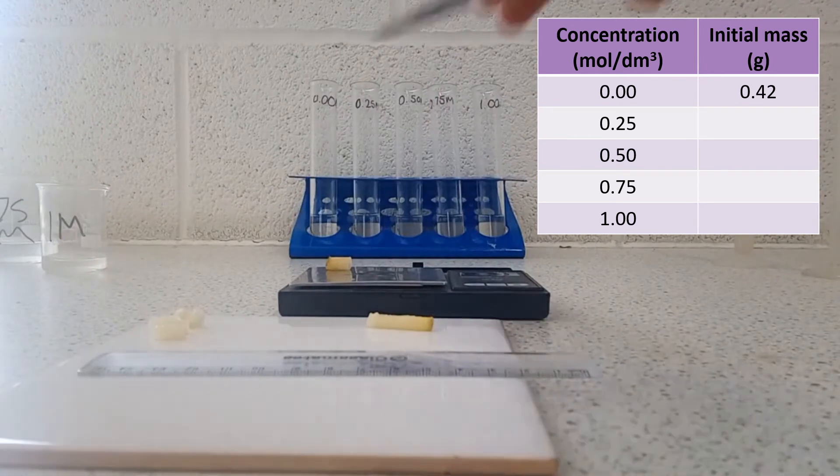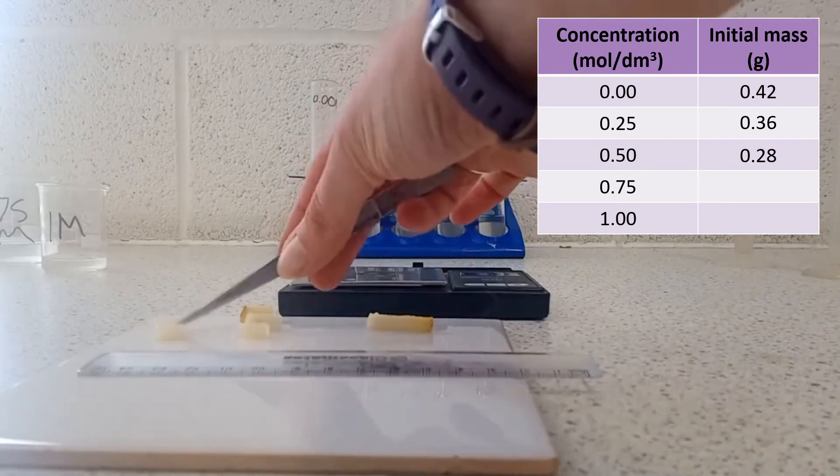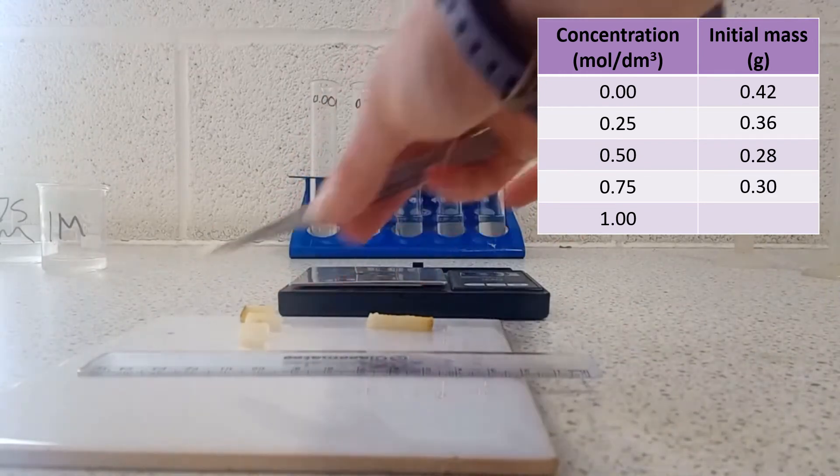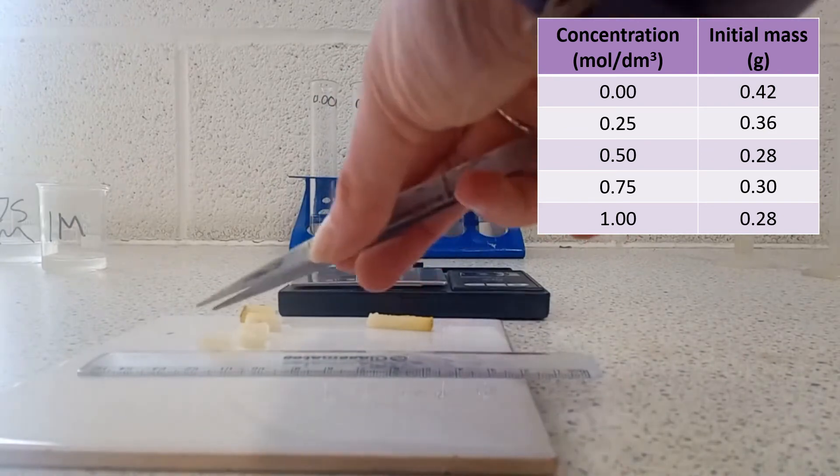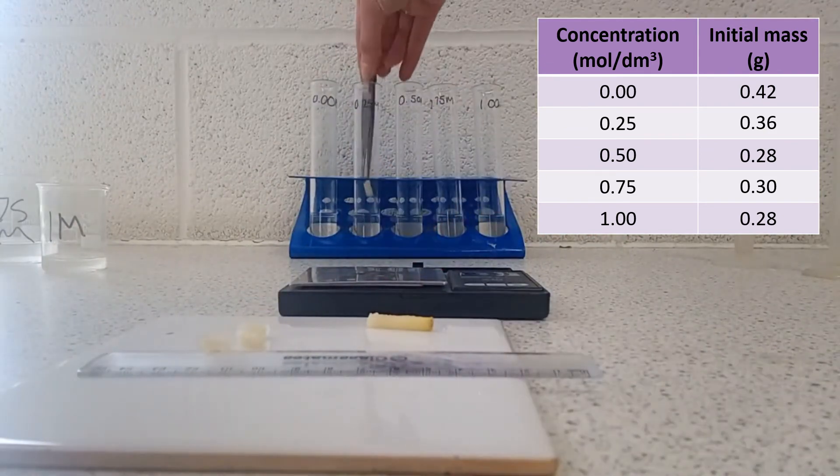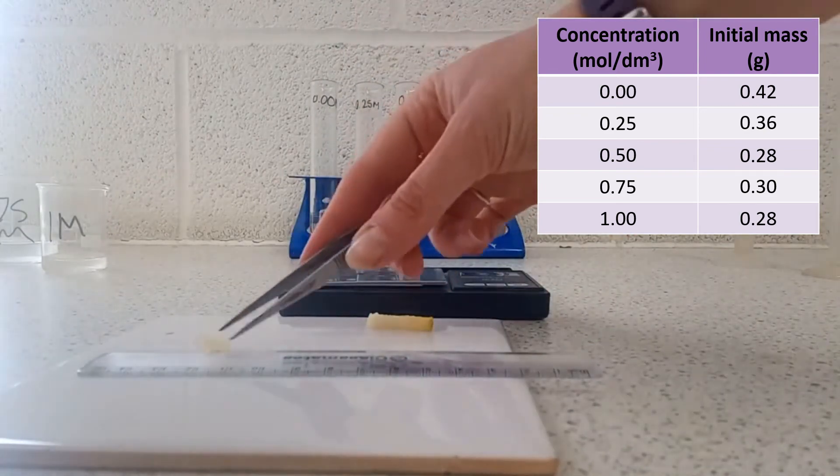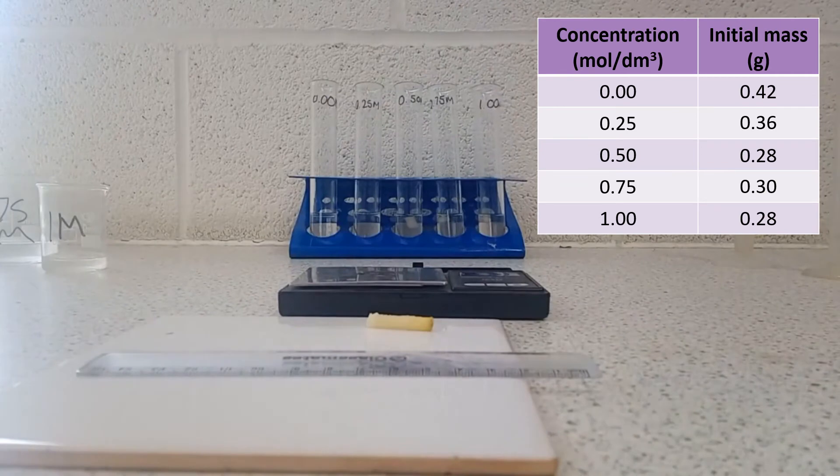So my first piece has a mass of 0.42 grams, then 0.36, 0.28, 0.30, and finally 0.28. So each of those pieces is now being put into an individual tube with a solution of a different concentration, and those are going to be left for the same period of time.